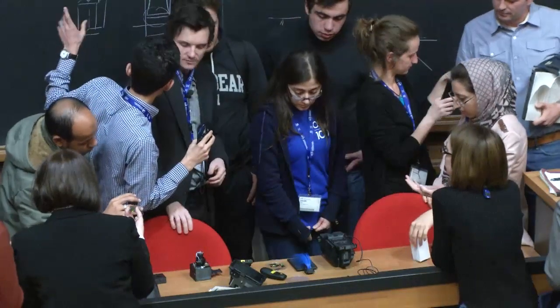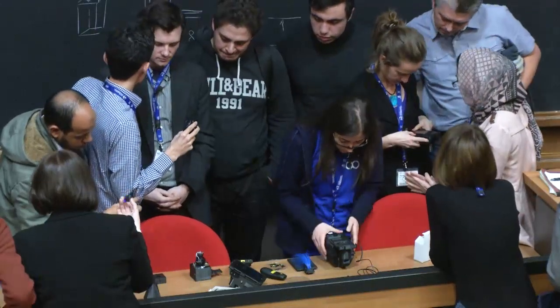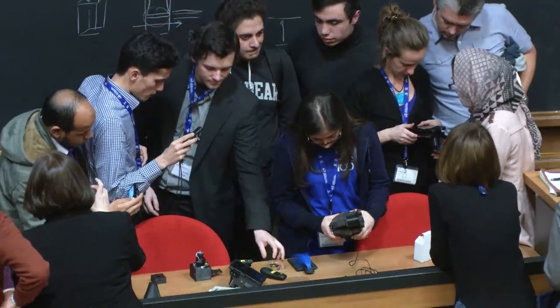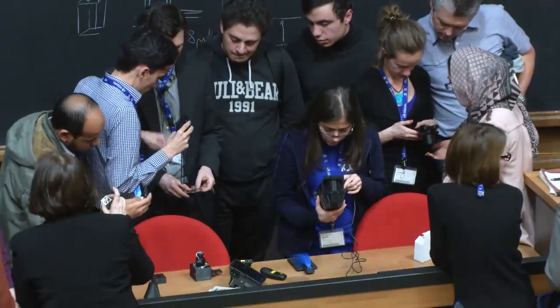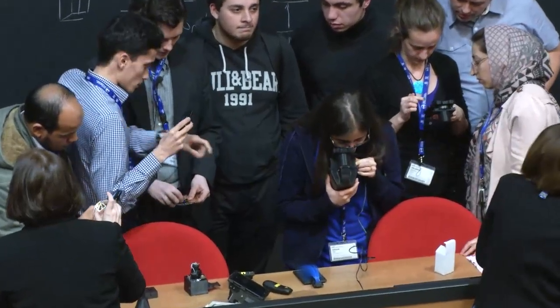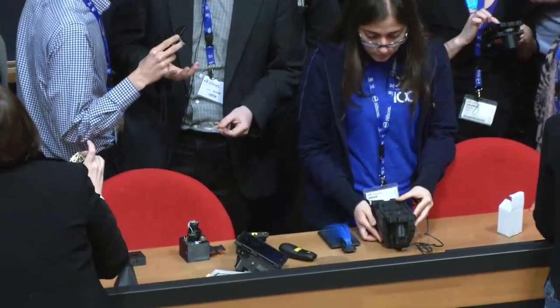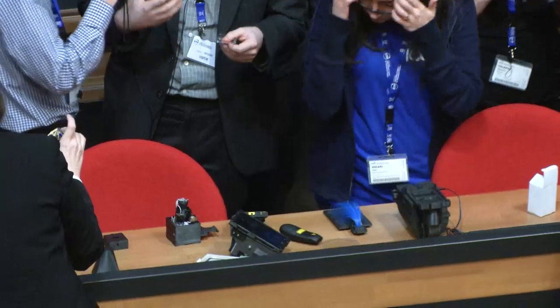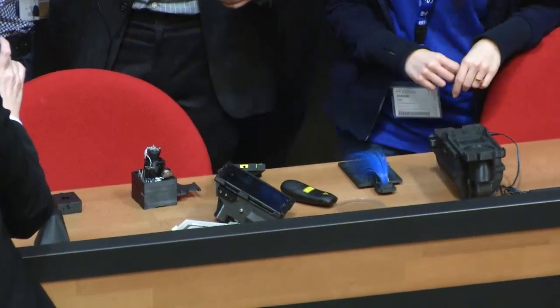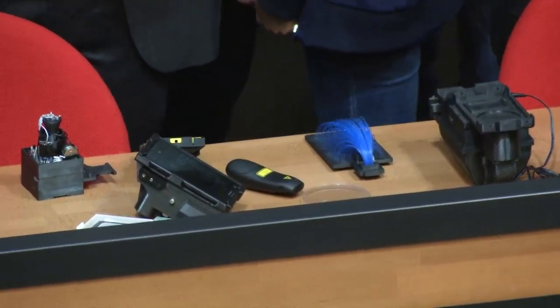I saw an image in your presentation, the absorption spectrum of gold nanoparticles. Yeah, so that's this. Will it be connected to a spectrometer, or can it be itself? Yes, that is the conventional way to read gold nanoparticle assays, plasmonic assays. Spectrometers, high-resolution spectrometers especially, are expensive. $1,000 maybe for a high-resolution spectrometer.